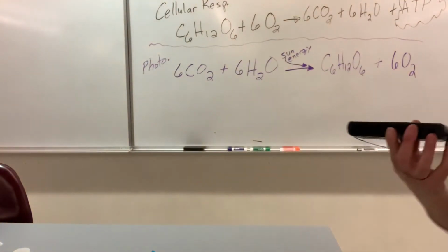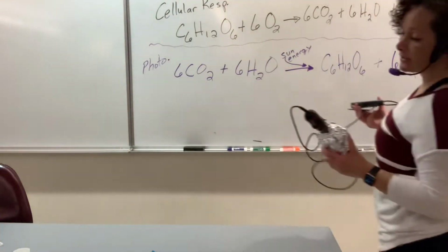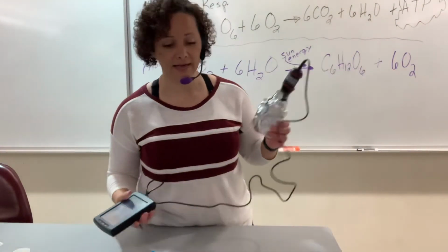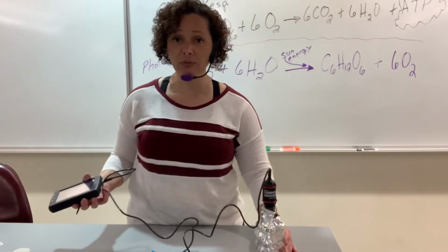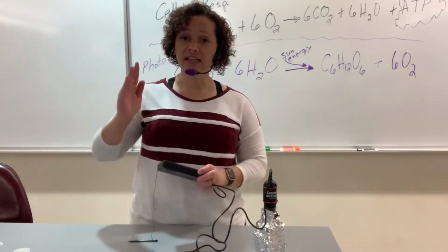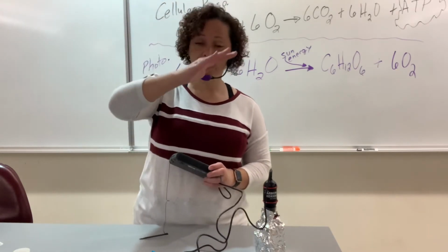Okay? So I'm just going to give it away. These peas have not been germinated yet, so my value is probably going to end up 0. But yours won't. Whenever you come in, yours will be germinated. And you're going to start to see a graph grow.